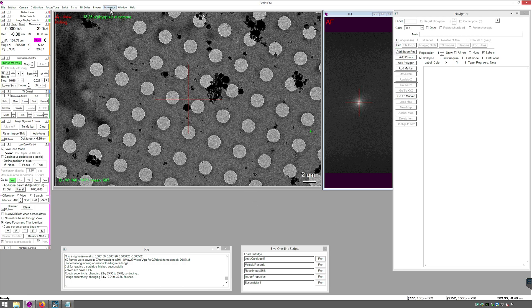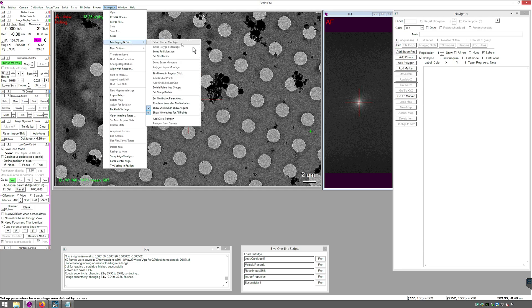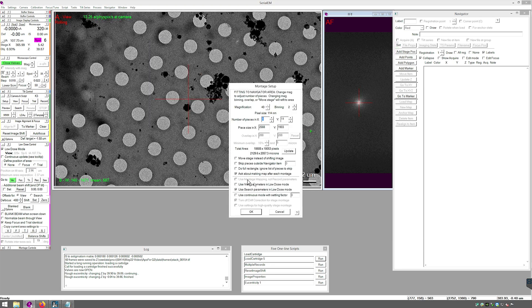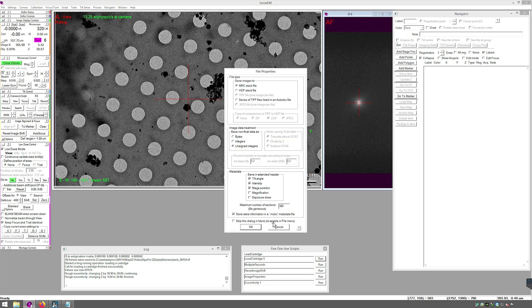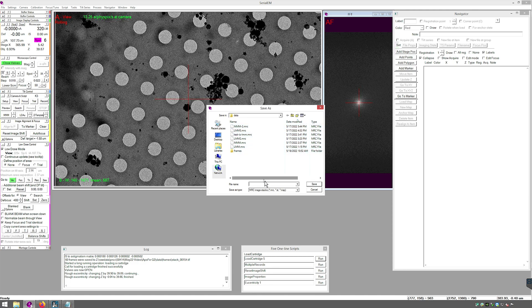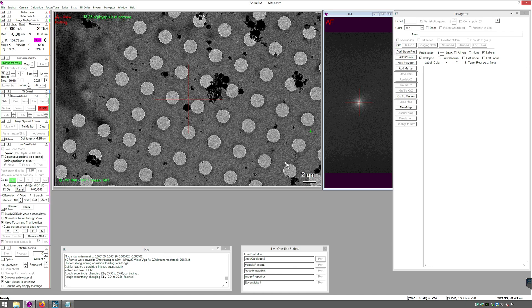Go to Navigator menu, Montaging and Grids, Setup Full Montage. Ensure that Move Stage instead of Shifting Image and Use Search Parameters are checked. Press OK. Save an MRC stack and press OK. Navigate to the proper project folder and save the file as LMM.MRC. Once the Start Button in Montage Control Panel is enabled, press it.